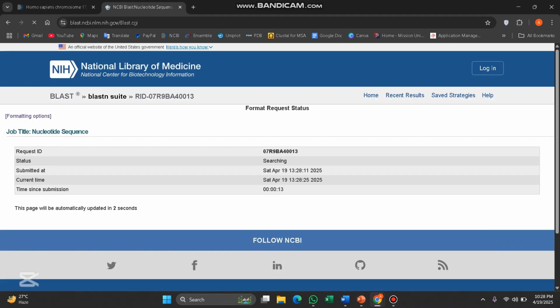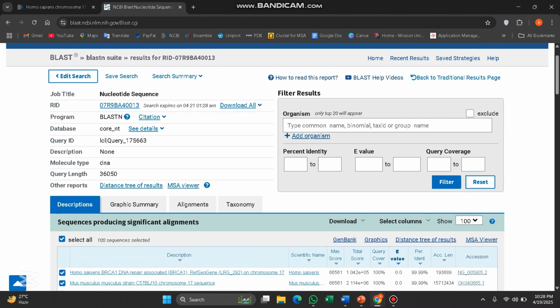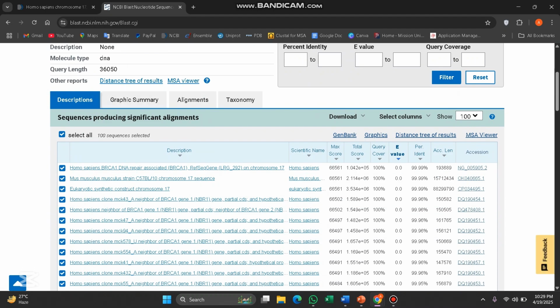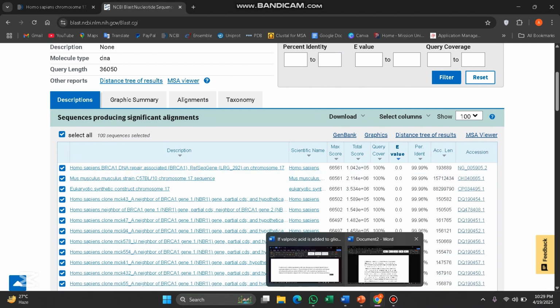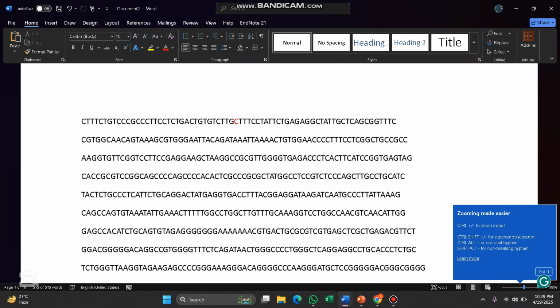Now it is going to take some time. Okay, now we got the result. It is 99.99%. When the sequence is 100% the same, there is a 100% percentage identity. But now it is 99.99% because we mutated the sequence from there.